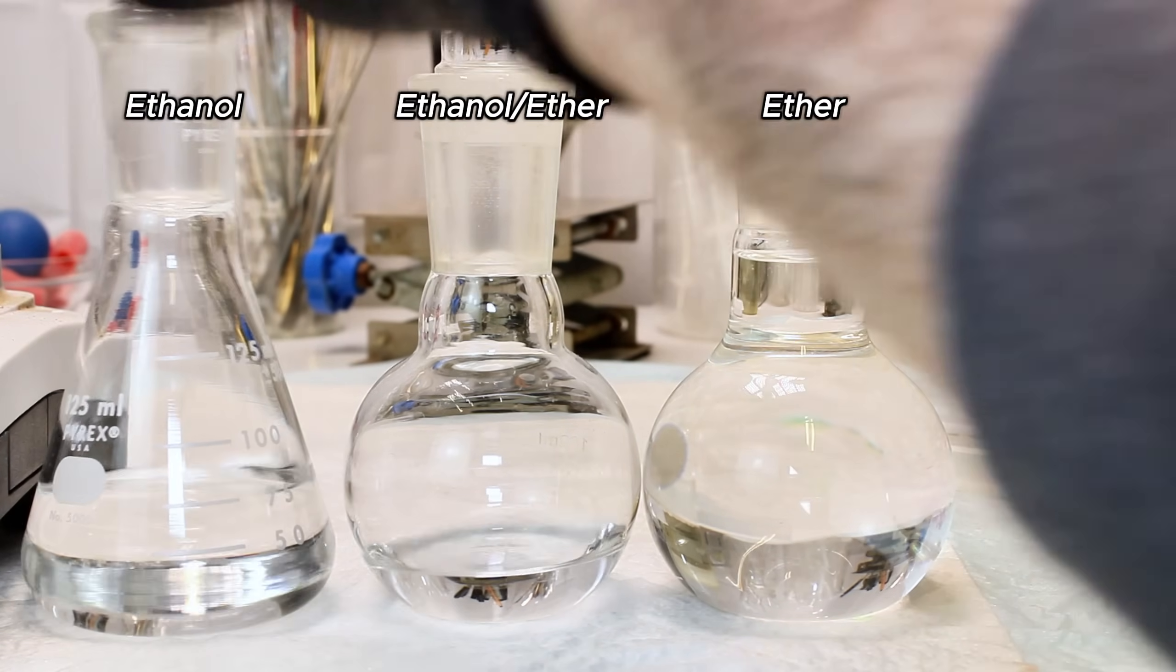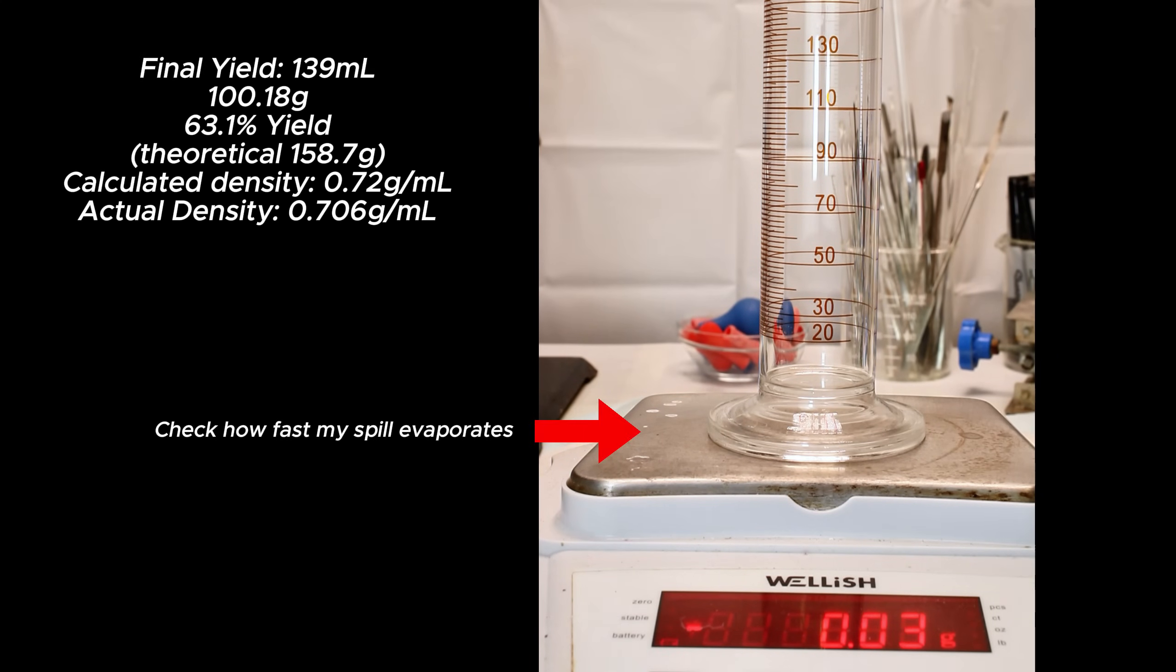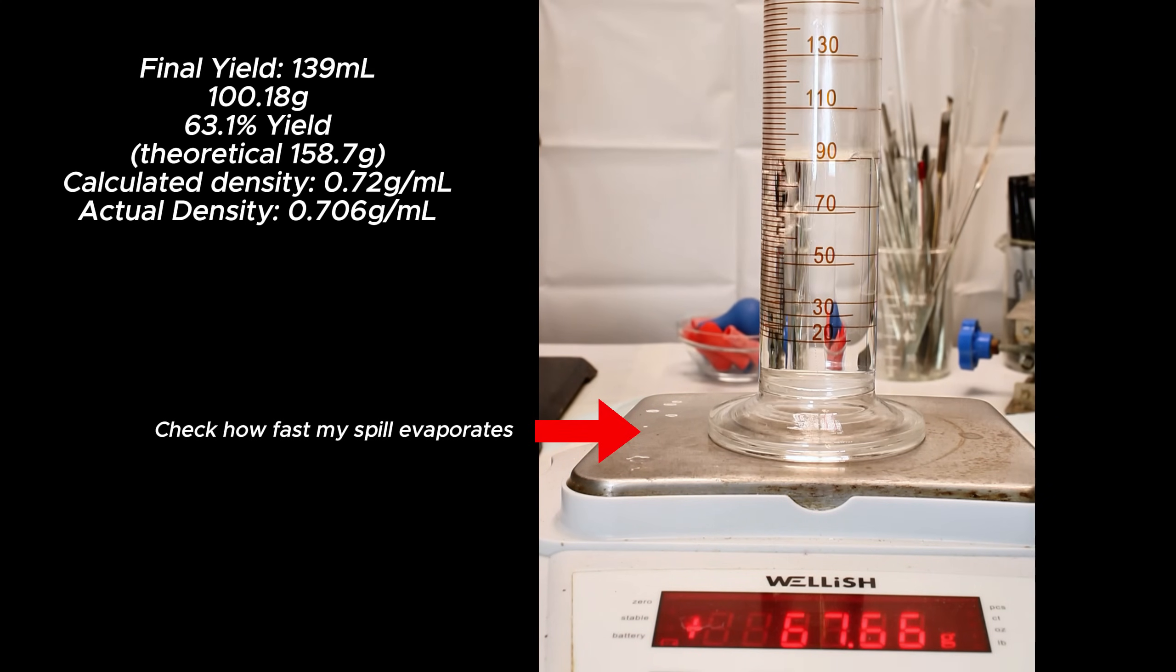In the end, this is what I'm left with. When I weigh my pure ether, I got a yield of 139 milliliters or 100.18 grams, which represents a 63.1% yield and a density of 0.72 grams per milliliter. This density is likely not accurate with such imprecise glassware, but it's close enough to tell me that my ether is mostly pure.